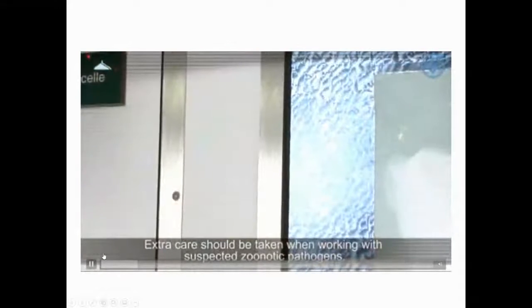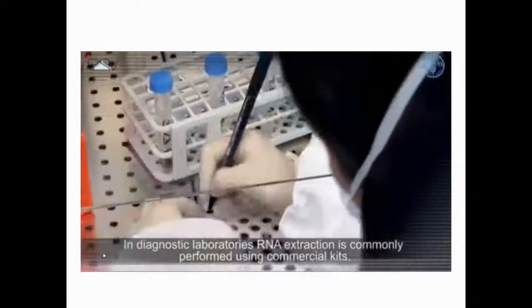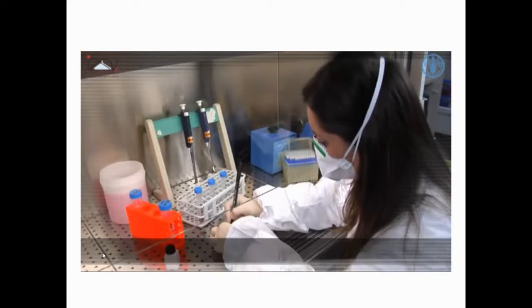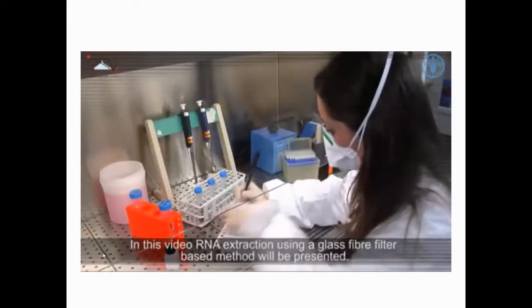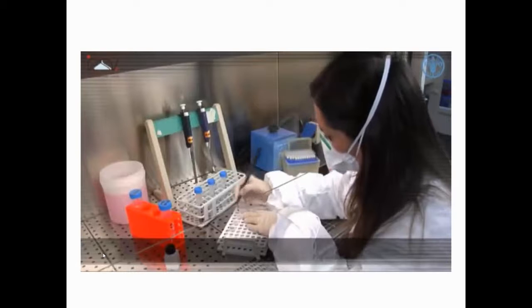A filter face mask. Extra care should be taken when working with suspected zoonotic pathogens. In diagnostic laboratories, RNA extraction is commonly performed using commercial kits. Commercial RNA extraction kits are generally based on the same principles and should be used following the manufacturer's instructions. In this video, RNA extraction using a glass fiber filter-based method will be presented.